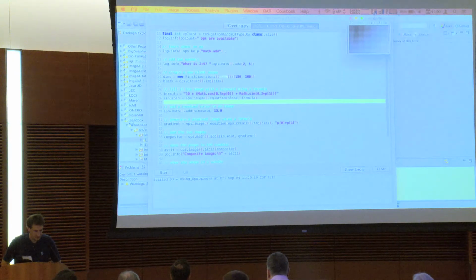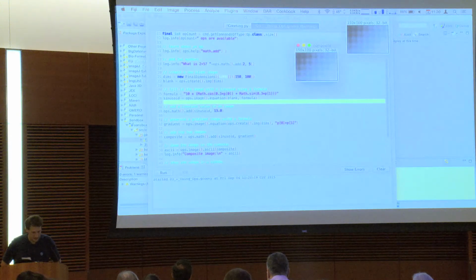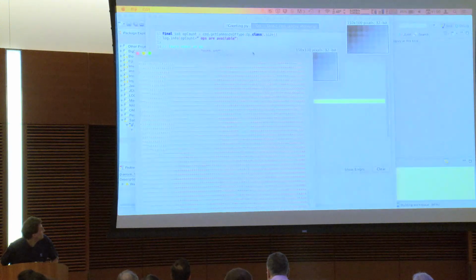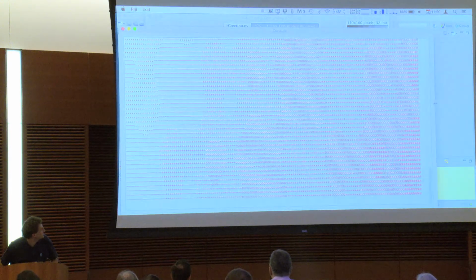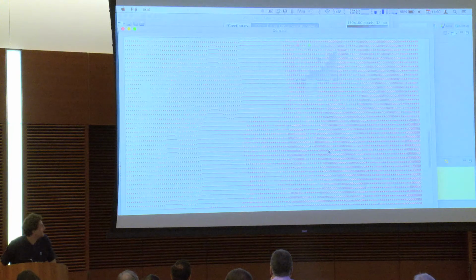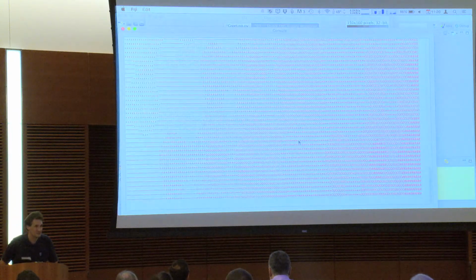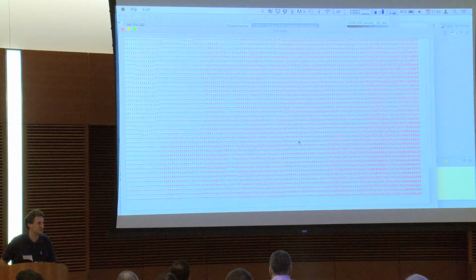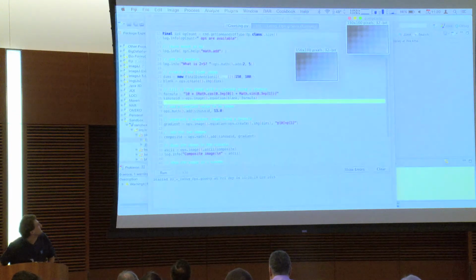There's one other thing I want to nerd out about for just a second that I'm the only one who cares about, but I love it. I wrote an ASCII op. This op takes an image and turns it into text. Here, I generated a sinusoid and added it to a gradient, so now it's a gradient sinusoid, and then I rendered it into text. This is really fun if you're on a cluster and you can print out your images over SSH. It's actually nice for unit testing too.